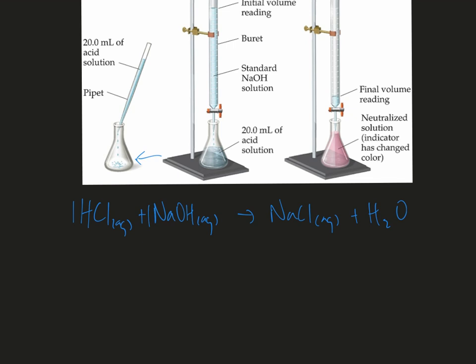Here in this diagram, you can see this. So here is the acid solution. It is colorless because it is acidic, and the phenolphthalein turns pink and is a permanent color change once the equivalence point has been reached.